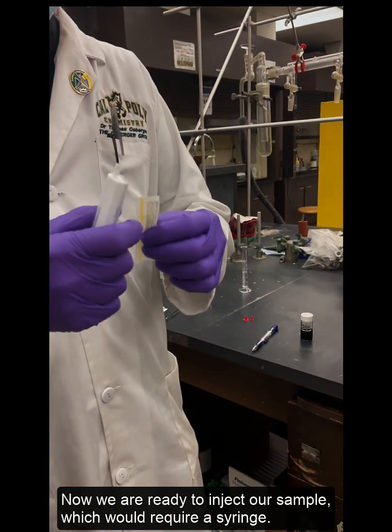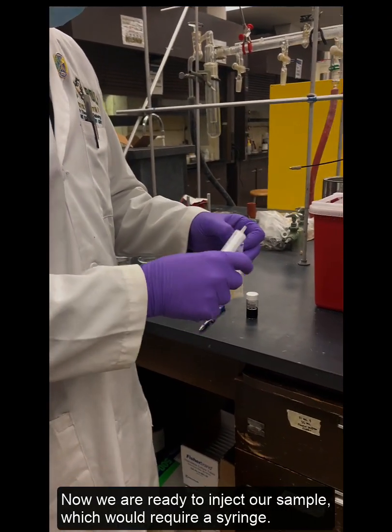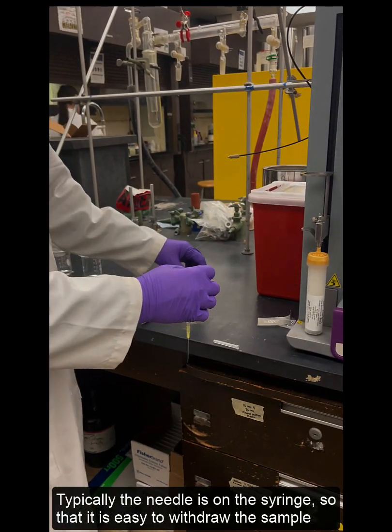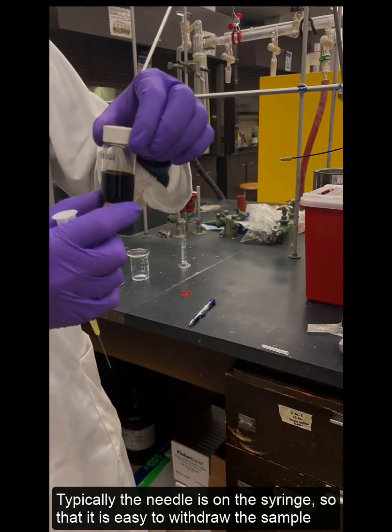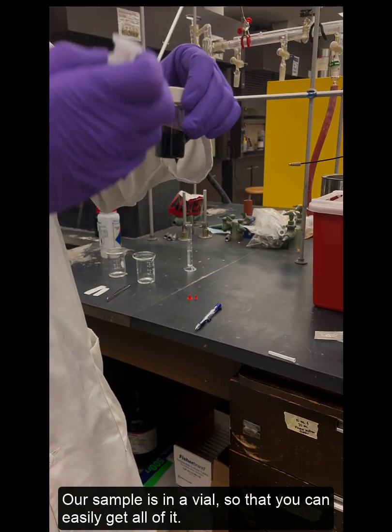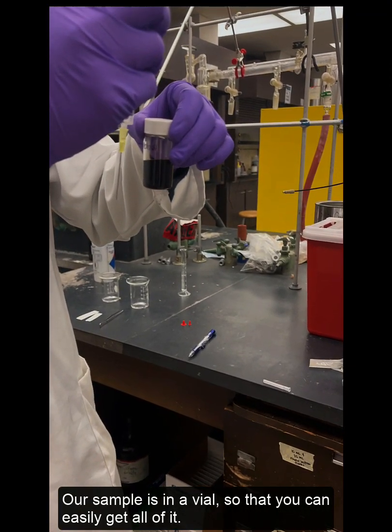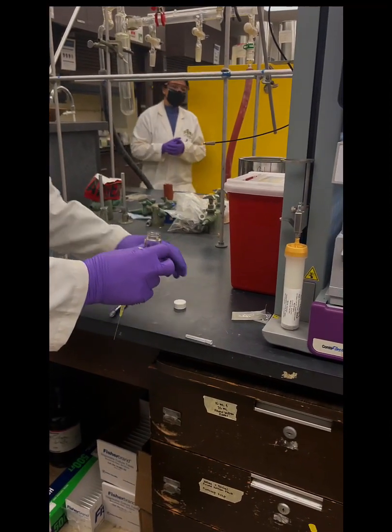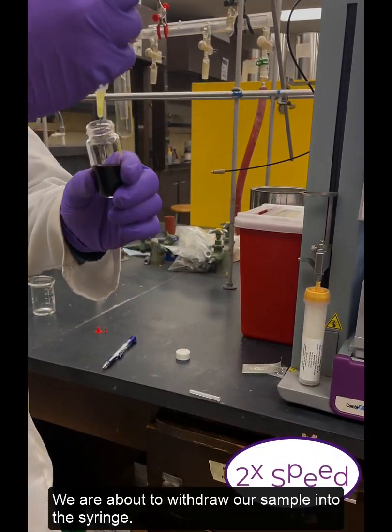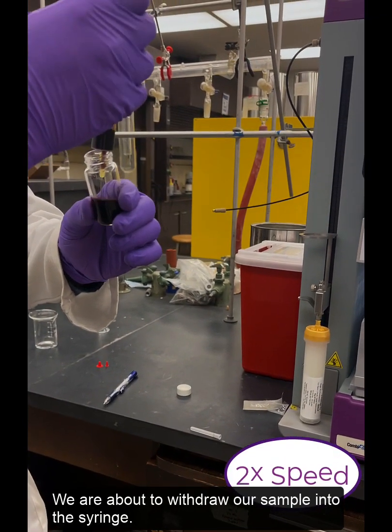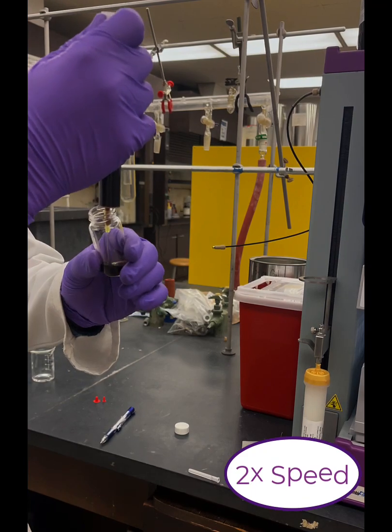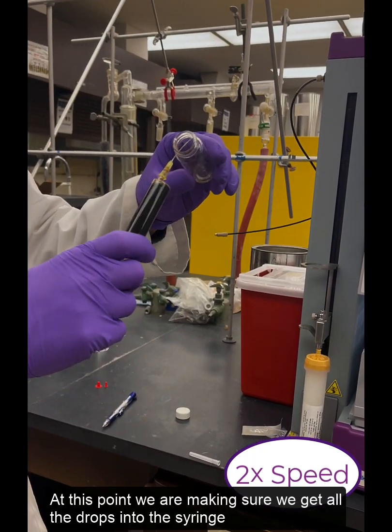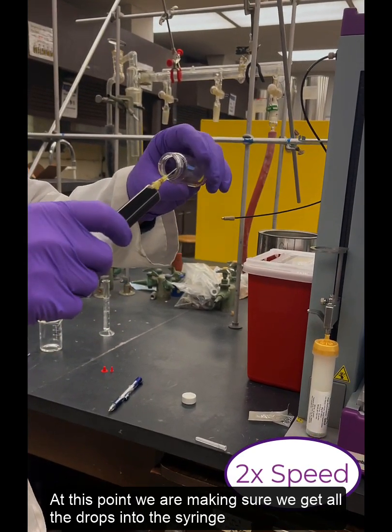We are ready to inject our sample which would require a syringe. Typically the needle is on the syringe so that it's easy to withdraw from our sample, and the sample is usually in a vial so you can easily get all of it. We're about to withdraw our sample into the syringe. We're just making sure we get all the drops from the syringe and ensuring there's no air bubbles in there so we could load our sample in properly.